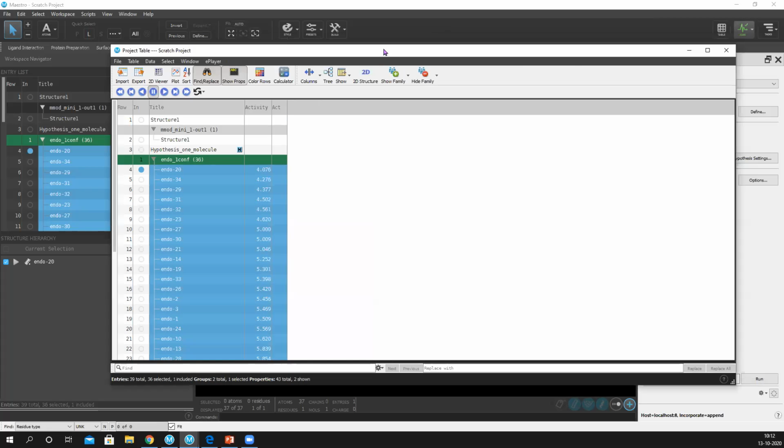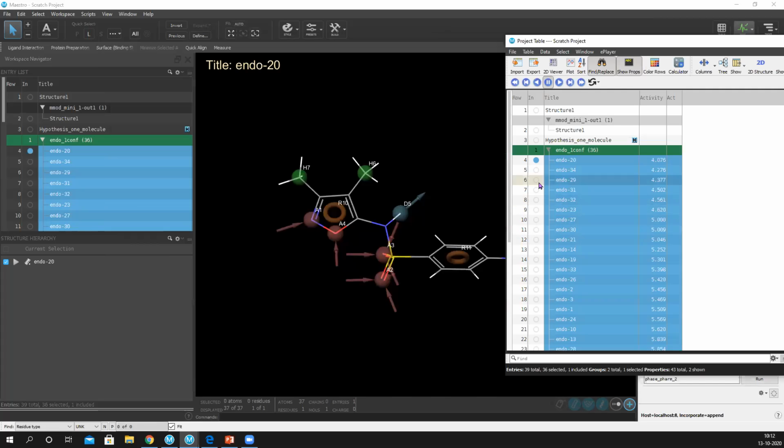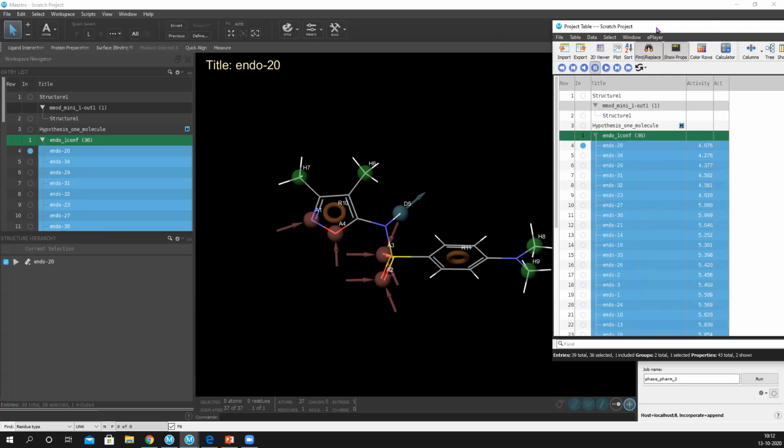Vinod, yeah, sorry to cut you. We have a comment asking you to go a bit slowly. Okay, fine, thank you, Vinod. If you notice, I have just browsed the files and the sessions are recorded. So I have not done anything hi-fi here. I've just imported and I'm just explaining. So please, it's my request. Okay, I'll try to go a little slower then.